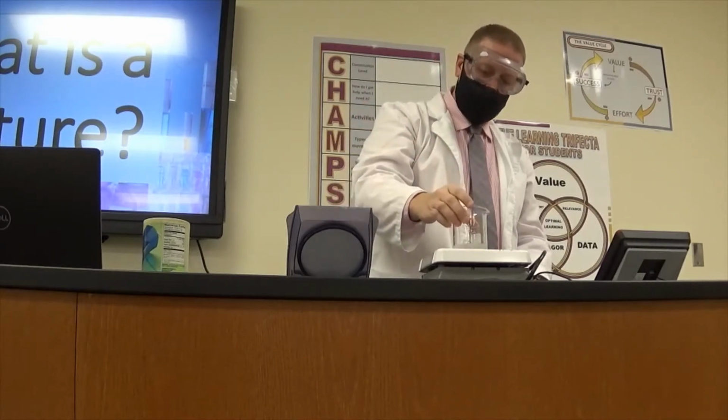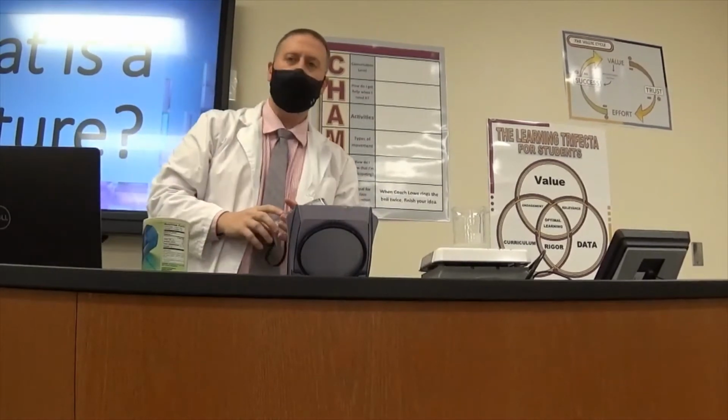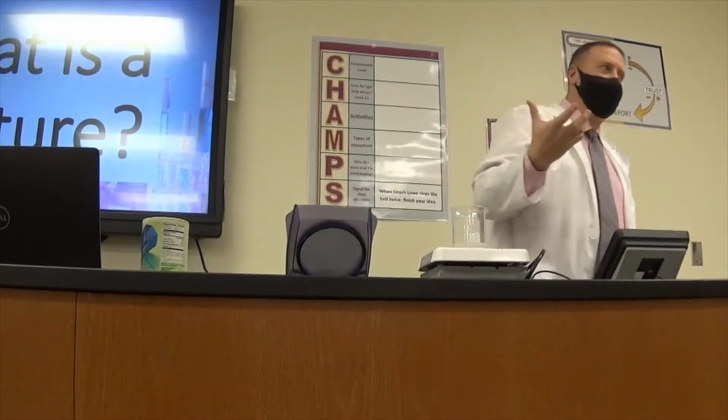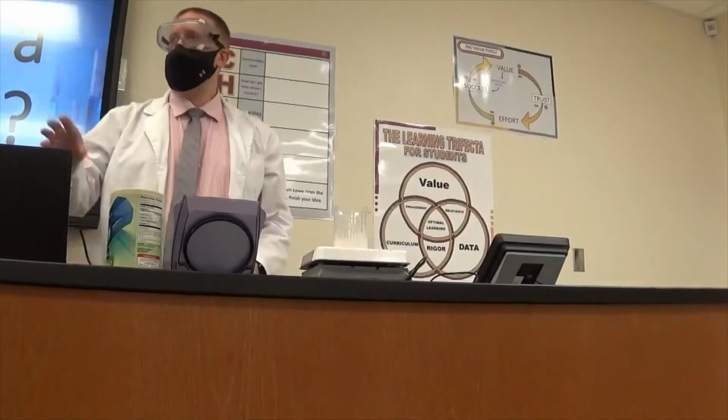And then I'm going to place that beaker of water on the hot plate, and we're going to let the water boil off. We're going to heat it up until all of the liquid is gone from that beaker. Under number 2 on your demonstration report, make a prediction, make a hypothesis. What do you think will happen when all of that liquid is boiled away? Go ahead and do those 2 things now. Okay, go ahead and pause what you're doing.